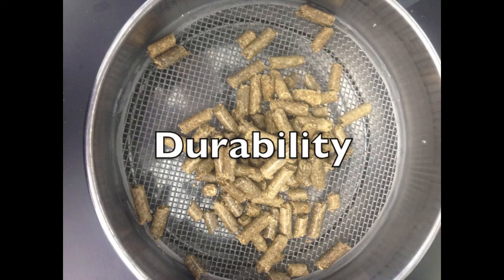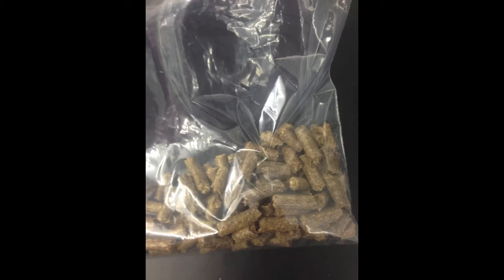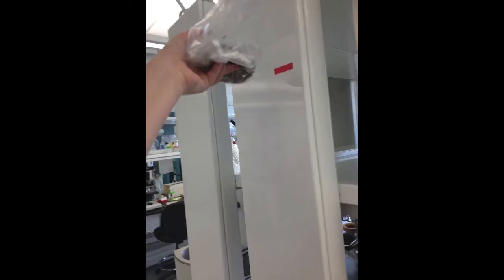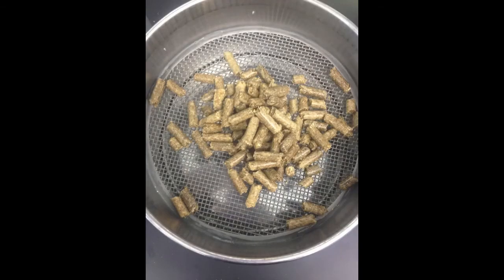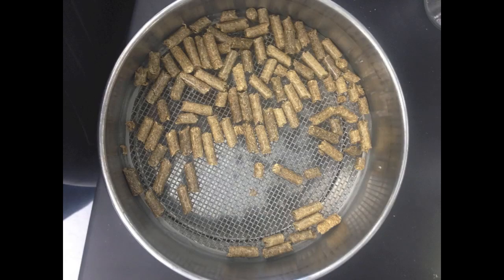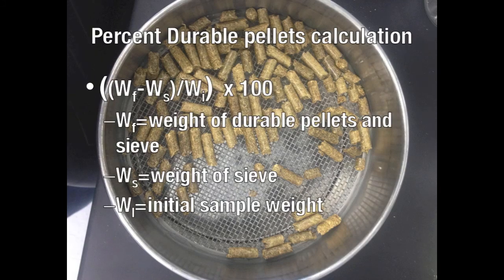Lastly, you will estimate the durability of the biomass. First, weigh out approximately 100 grams of pre-screened biomass into a tared poly storage bag. You can use the screened sample from your percent fines determination. Remove excess air from the bag and seal it. Fold the bag horizontally over a hard surface at a height of 6 feet and drop it a total of 10 times, ensuring that the bag remains sealed after each drop. Sieve the sample by tilting it side to side 10 times; the durable pellets will remain in the sieve. After sieving, weigh the sieve with the remaining pellets. Then calculate the percent durable densified pellets by taking the weight of the sieve and durable pellets minus the weight of the empty sieve, divided by the initial sample weight, and multiplying by 100.